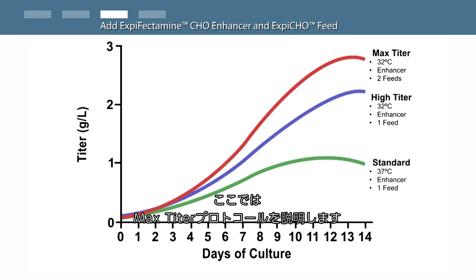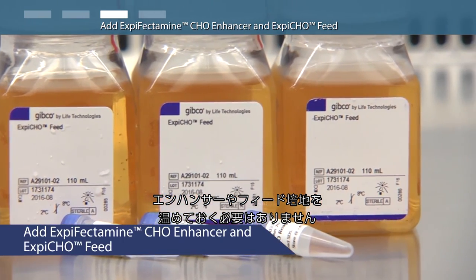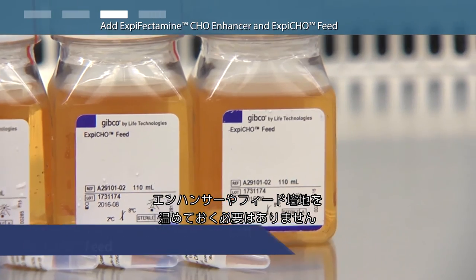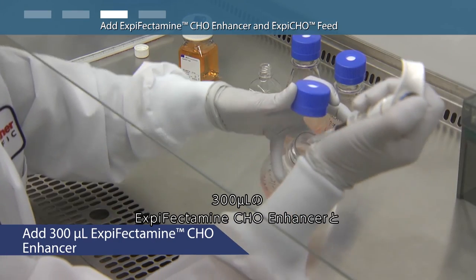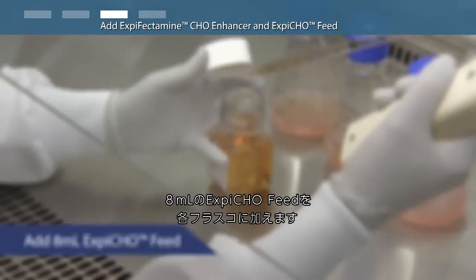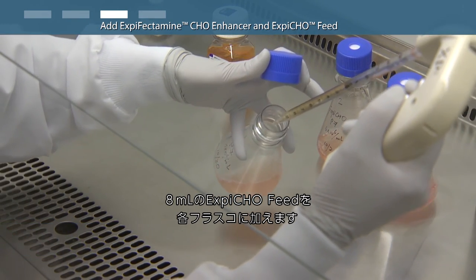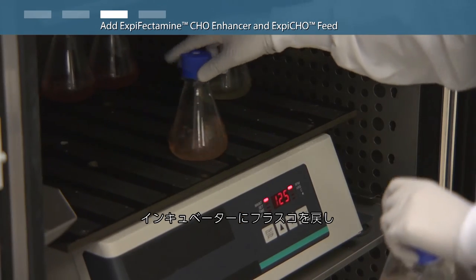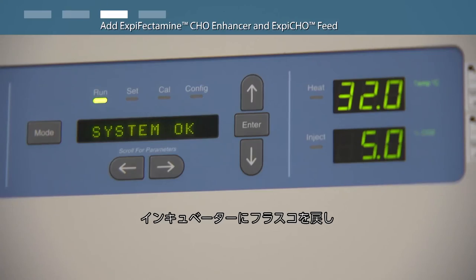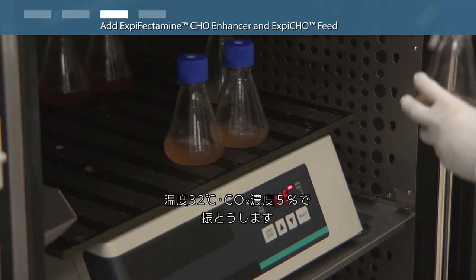In this video, we will follow the max titer protocol. It is not necessary to pre-warm the ExpiFectamine CHO enhancer or the ExpiCHO feed prior to addition to flasks. On the day after transfection, add 300 microliters of ExpiFectamine CHO enhancer and 8 milliliters of ExpiCHO feed to each of the 250 milliliter flasks, gently swirling each flask during addition. Transfer flasks to a 32 degree Celsius incubator with a humidified atmosphere of 5% carbon dioxide with shaking.